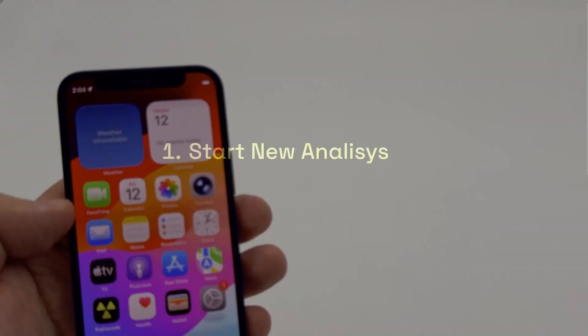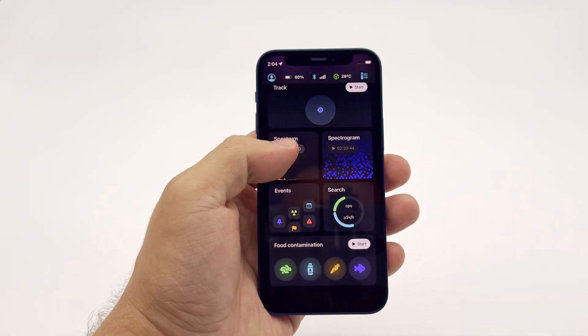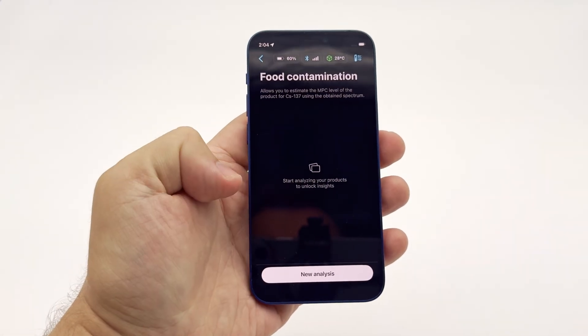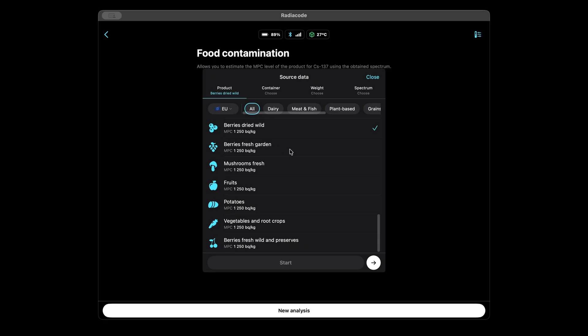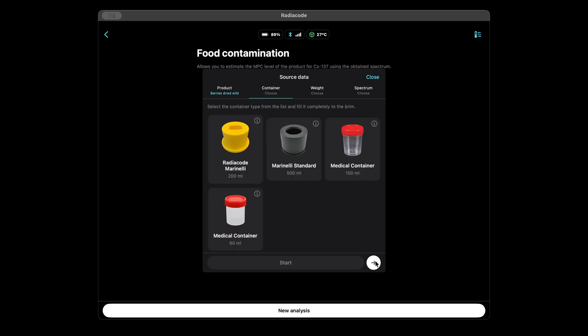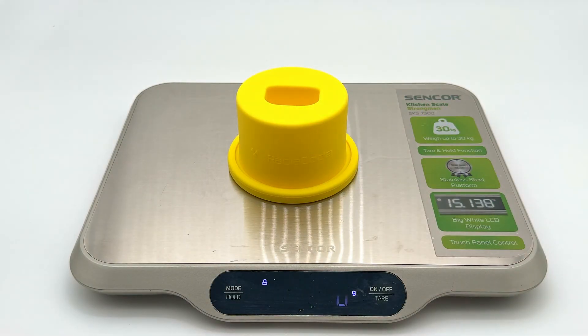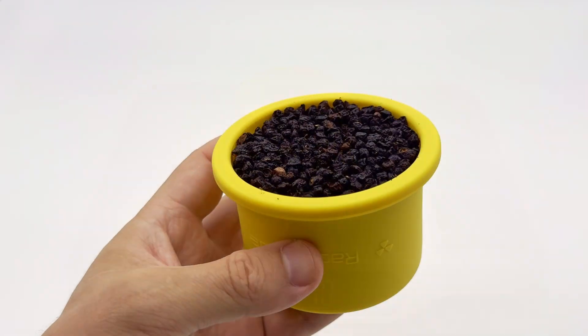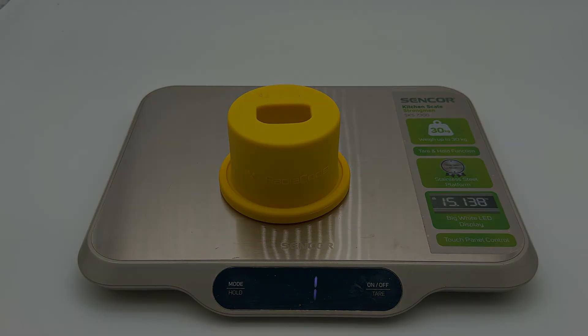Step-by-step instructions. Step 1: Open the Radiocode app and connect your device. At the bottom, select Food Contamination, then New Analysis. Choose the product type — for example, dried berries — and select the matching Marinelli beaker volume. Then enter the net weight of the food sample. To do this, weigh the empty container, then fill it to the top with the sample, and calculate the difference.